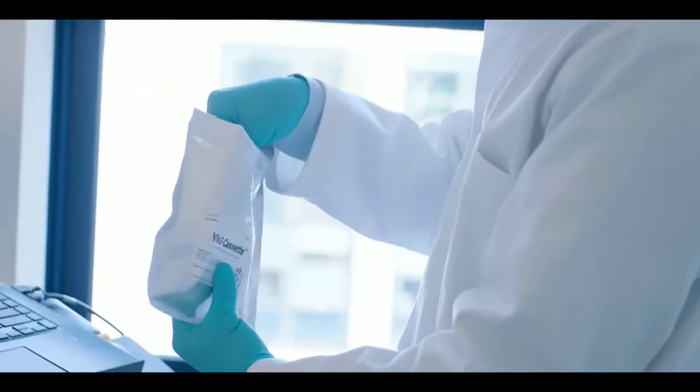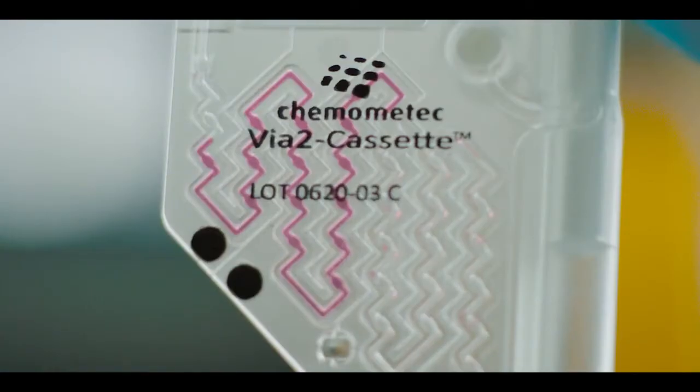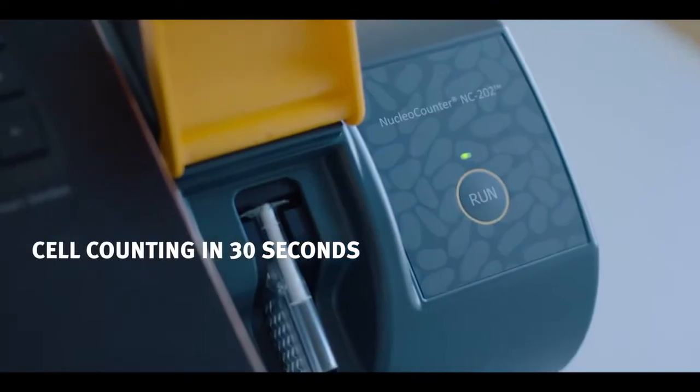The Nucleocounter NC202 can count all mammalian cell types using a single protocol. Cell counting only takes 30 seconds.